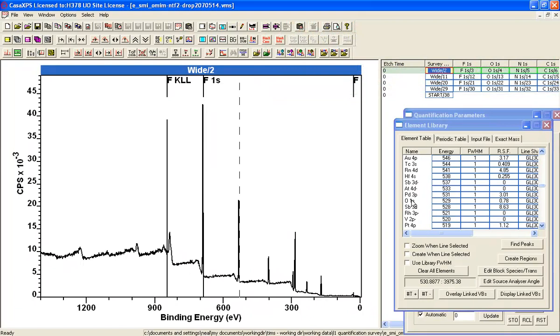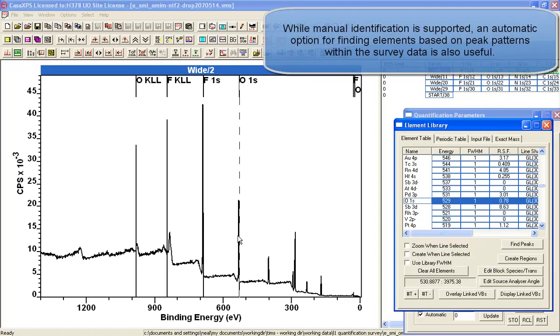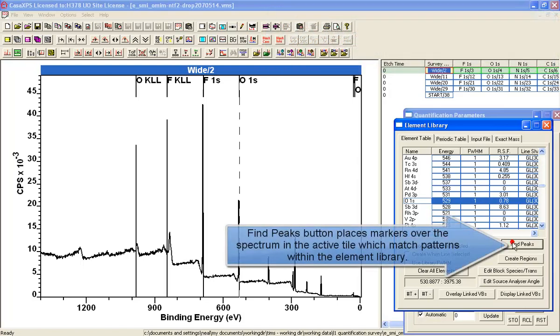And there's another one, and that's probably Oxygen. And yes, we can see there's an Auger peak here corresponding to the Oxygen 1S, so Oxygen is plausible. And we could go through and identify these peaks individually, or we could say find peaks.